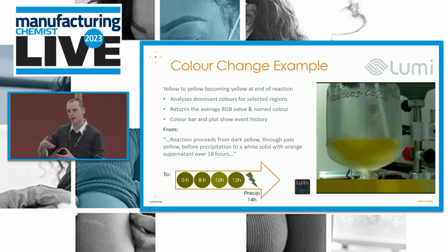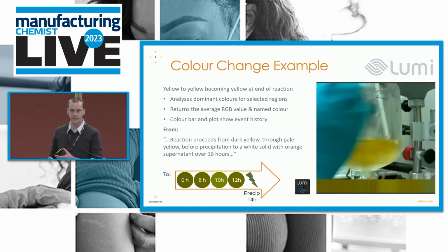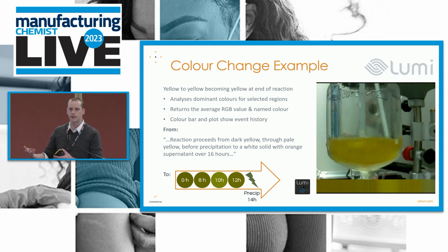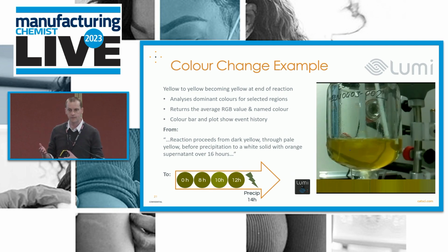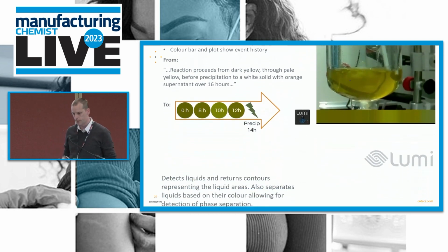In years gone by, we would have come in the next day and would have noticed the same thing. But when did it happen? What was the impact on the quality of that batch? We can now document that, and this is a useful data point, so that if something does happen it's now a hold point. If the quality of the system of the chemistry is okay, then we can use that as a data point to share with manufacturing colleagues that if something falls out of suspension at this time, that's okay. We've got that data point along with the times that go with that.